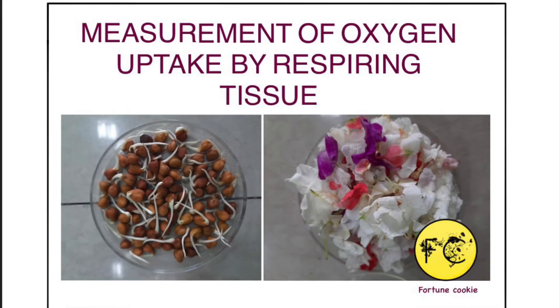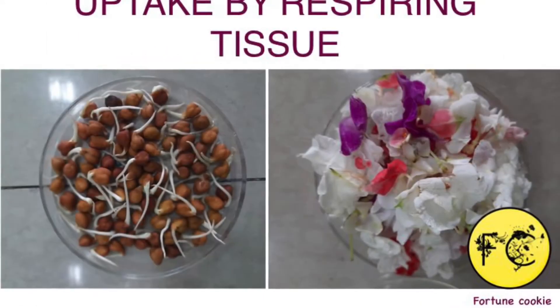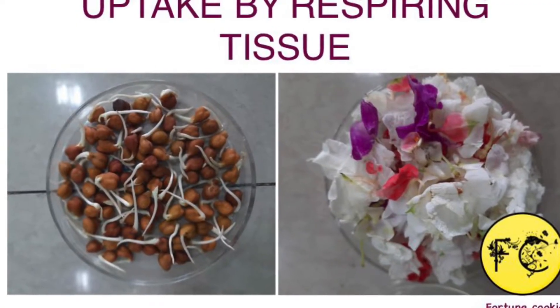Today's video is on the measurement of oxygen uptake by respiring tissues. We will be comparing two different tissues: one of the germinating seeds and one of the flower petals.